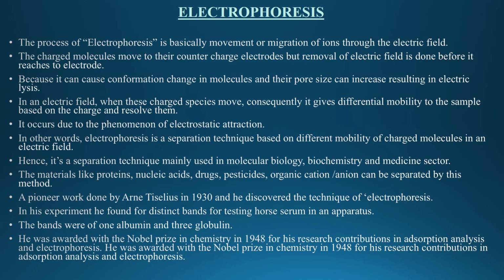In an electric field, when these charged species move, it gives differential mobility to the sample based on the charge and resolves them. It occurs due to the phenomenon of electrostatic attraction. In other words, electrophoresis is a separation technique based on different mobility of charged molecules in an electric field.